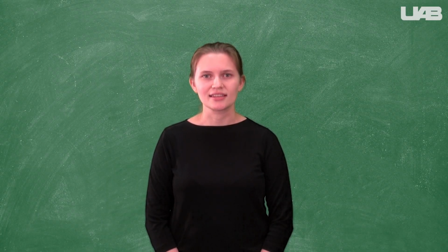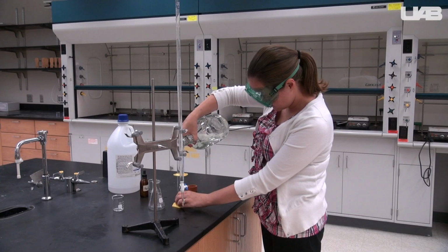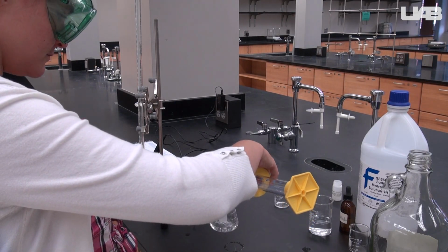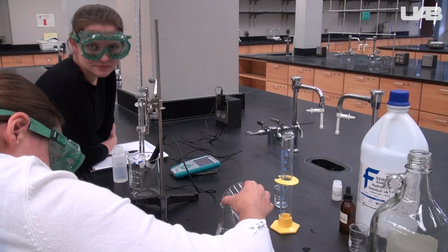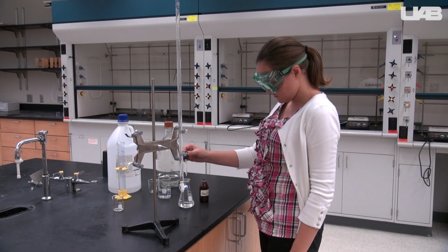During this exercise, you will be practicing your technique with a known acid before you try working with the unknown acid in exercise 2. You'll add 20 to 30 milliliters of acetic acid to an Erlenmeyer flask, then dilute it to a total volume of about 40 milliliters. Add a few drops of phenolphthalein to the flask.